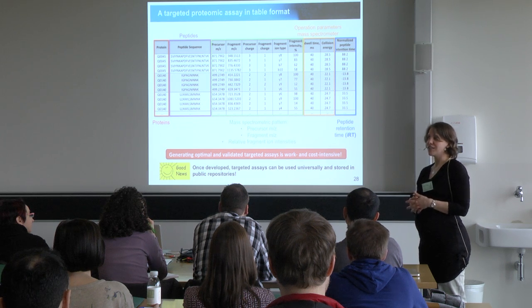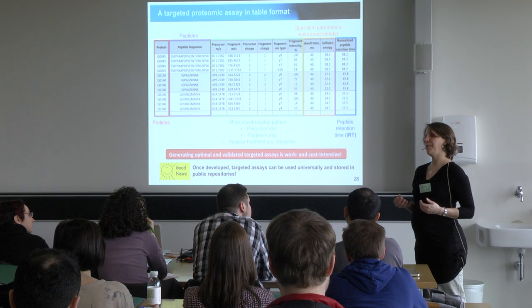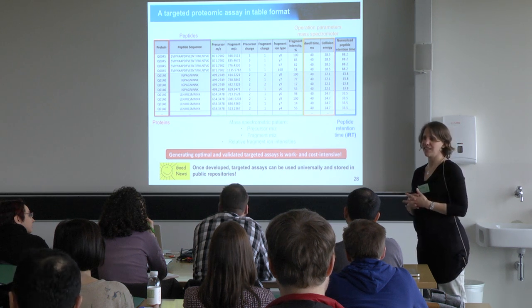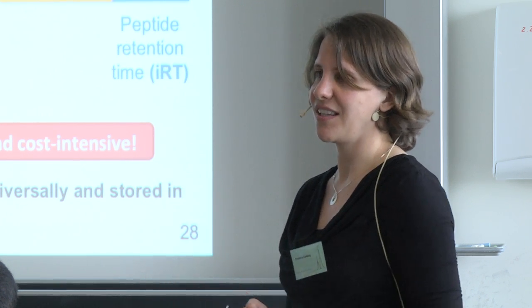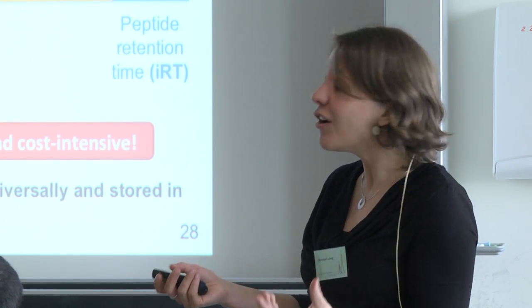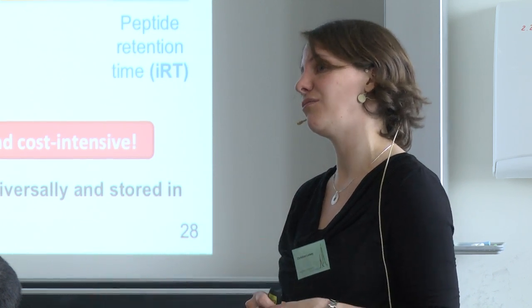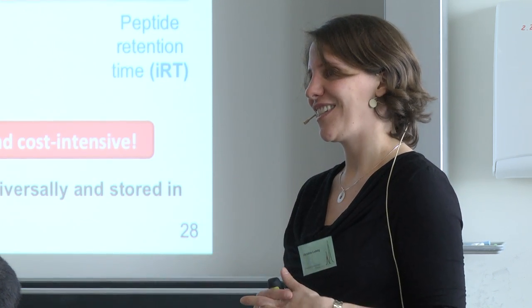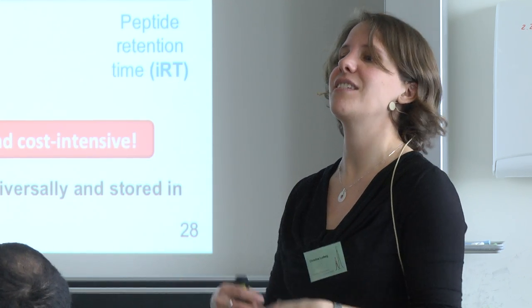If you cannot and you want to do a very decent job, you try to target all of them and see which ones you can detect, and you would assume that the ones you detect are the prevalent ones in the sample. And ideally also, if you do relative quantification, each version should give you the same ratio. The non-oxidized one should show the same ratio change between 2 samples as the singly oxidized and the doubly oxidized.